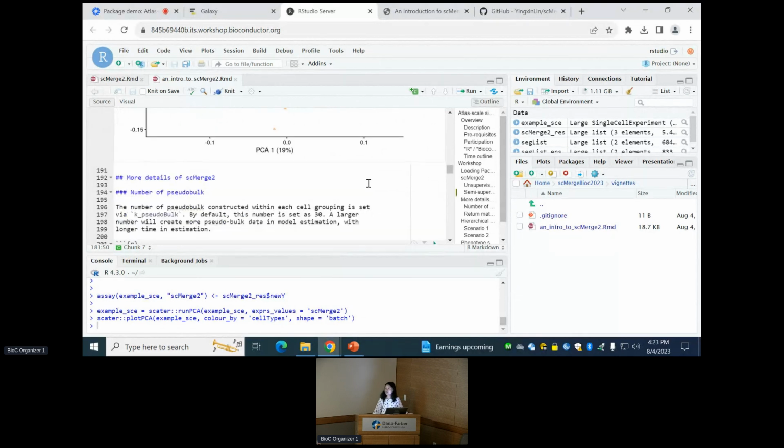Question: so the difference with the previous one is that it was doing its own clustering, and here you're essentially giving it the clusters, but it doesn't care what the description of the cluster is? Yeah, no, it's just a partition of the cells into clusters. Okay. But in terms of performance, what's better, giving cell types or doing it unsupervised? It depends on whether you like my own clustering algorithm, which is just shared nearest neighbors plus Louvain clustering. If you think this is not good for your data set or this batch, then the guided one will be better.